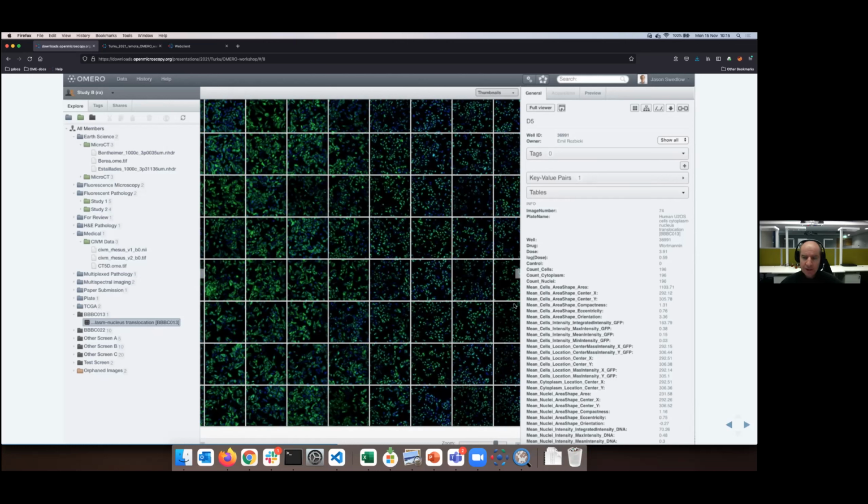And the showing is here in Omero Web, which is our main client. Do you remember the word client from the beginning? This is basically your window into that server where your images are sitting. This is a concept which you just have to live with if you've never done anything like that remotely.